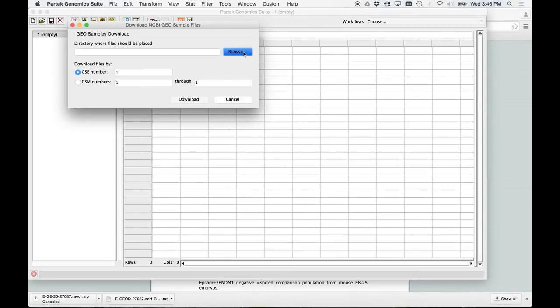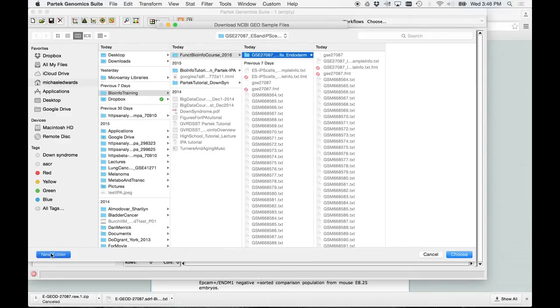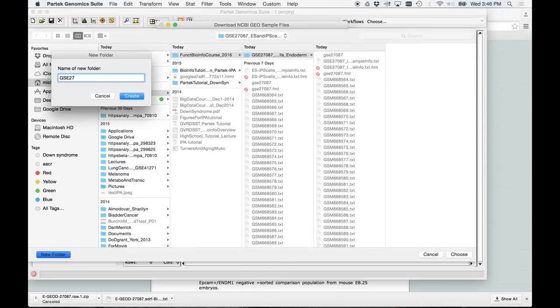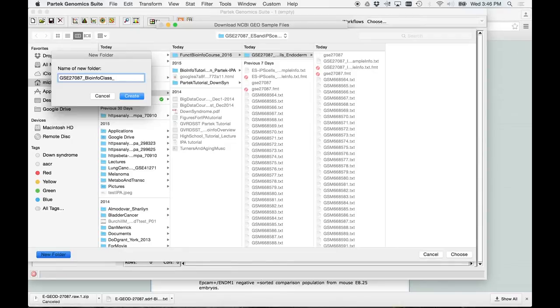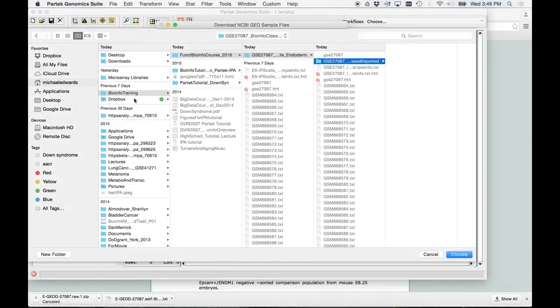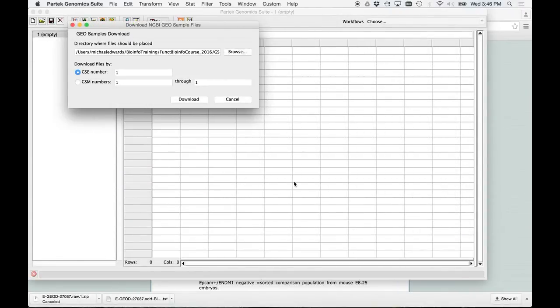Okay, so just basically pick where you want to store this. I'm going to store it in, I'm going to make a new folder. Usually what I do is I put the accession number, so GSE27087. Now I'll put an underscore BioinfoClass processed. Processed, import. So I'm going to create that. I'm going to choose that.